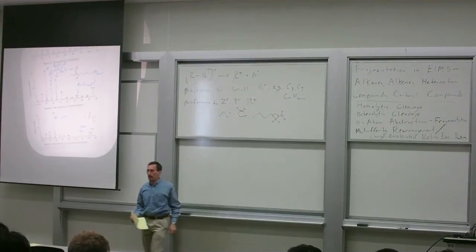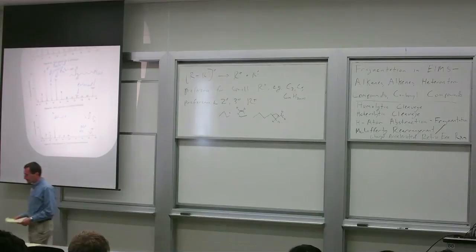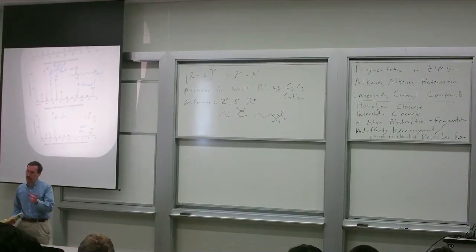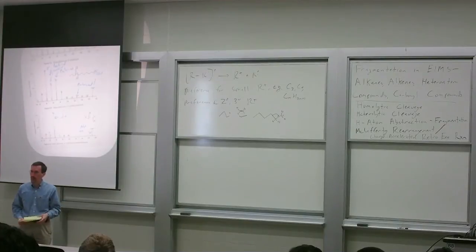Yeah? What are the peaks, the smaller peaks below? Just one below? Yeah, like one or two below. One or two below is typically further loss of a hydrogen atom or a hydrogen molecule, H2. So like twice? Well, if you're losing two, it'll probably be a hydrogen molecule basically spitting out H2. If you're having one loss, the loss of one, you'll be losing a hydrogen atom.